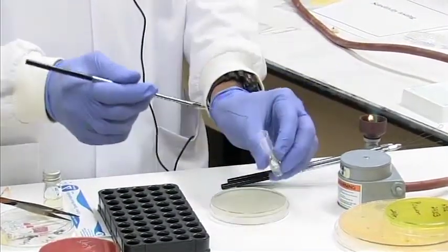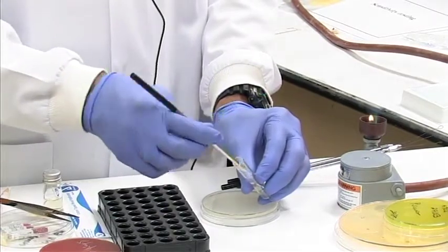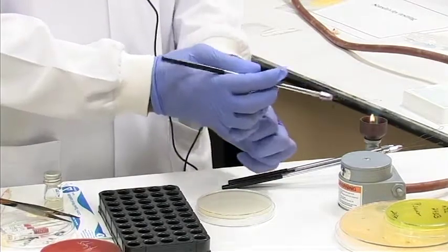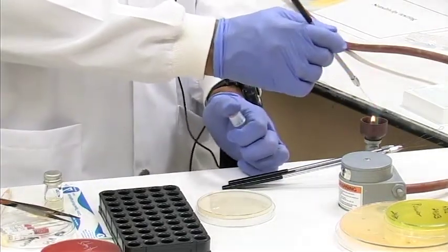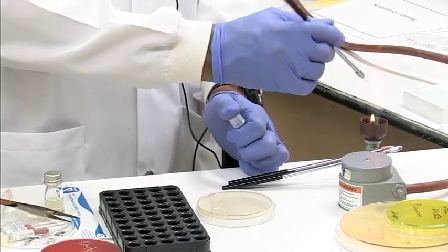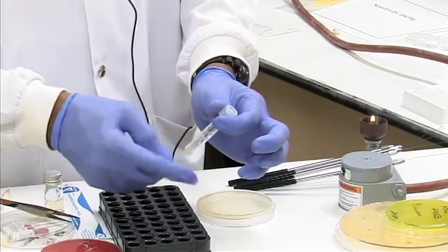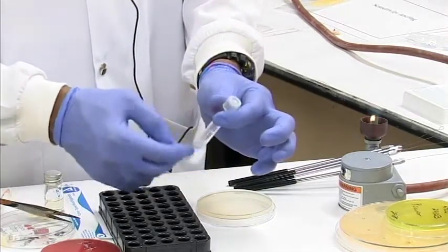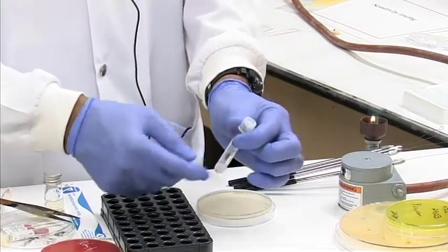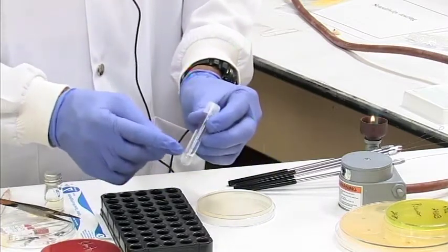Again, light the flame. Inoculate it. Tap it back. Flame back your loop to make sure you kill the bacteria. And then we have to mix or resuspend this bacteria in the saline to achieve a certain turbidity or standard. Either you can mix it in this way, or you can use a vortex and you'll vortex the tube to get a suspension. Now the strength of the suspension is very important.